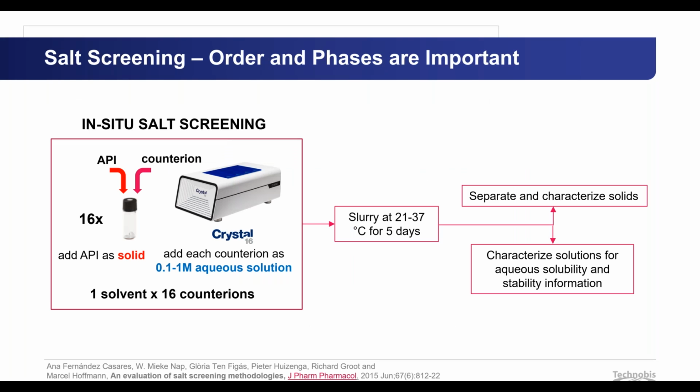We also have an application note, and I always refer to a paper from 2015 where some of my ex-colleagues at Avantium Crystallics have done quite some work on optimal salt screening.